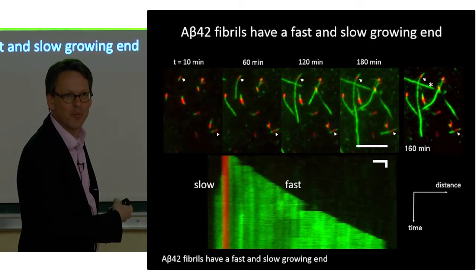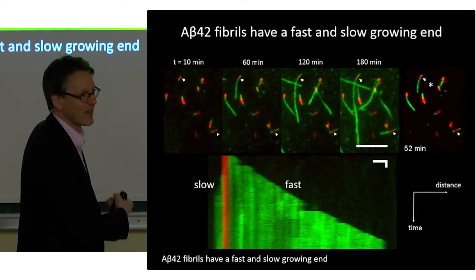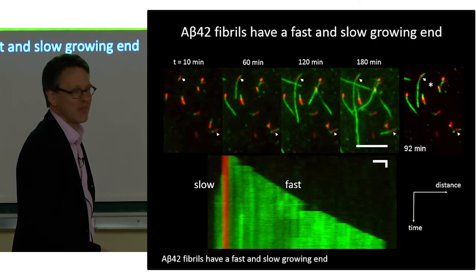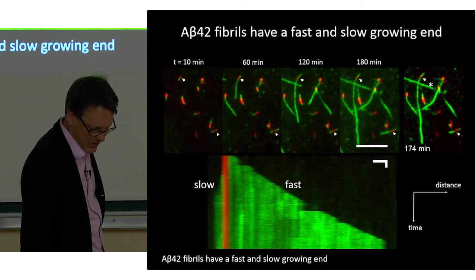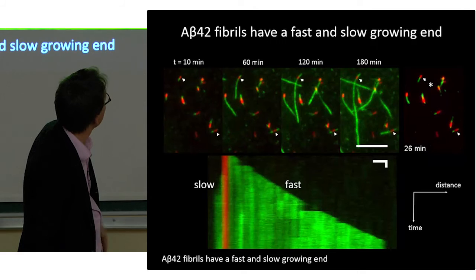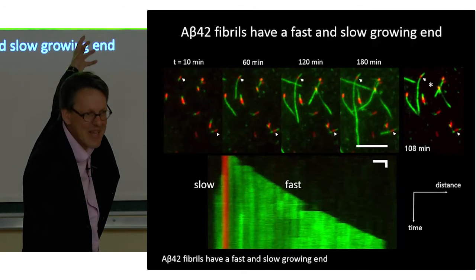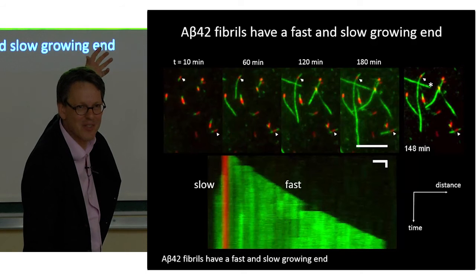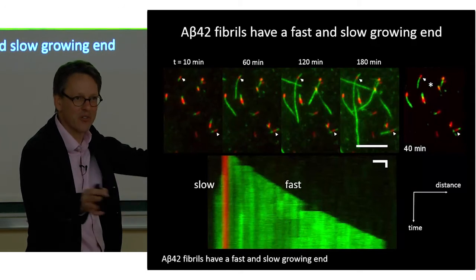So why do you bother with this structured illumination trick? You just told us it's so quick, but in fact you could probably just do this; this is not really a test for the technique, and that's true. So the funny thing is, this is what happens thermodynamically, right? This is a kinetic process. This is a kinetic process that's just physical chemistry. You have a solution of the stuff, you put it on the cover slip, and it grows.